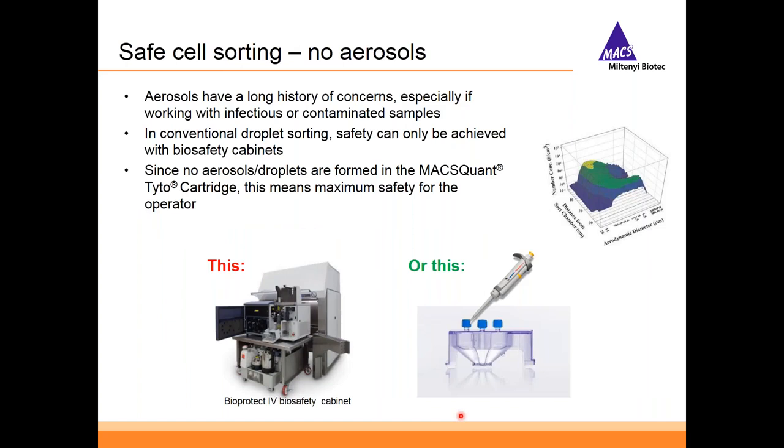Yes, another aspect I would like to talk about is safety during cell sortings. And this is, of course, an issue for several applications, especially when you are going to sort patient material which might not be tested already, or even where you know it is infectious, or other infectious materials such as bacteria, yeast, parasites, stuff like that. And yeah, it has a long history of concerns, especially when working with those kind of materials. And in conventional droplet sorters, as I said before, they are open systems. This safety can only be achieved when biosafety cabinets are used.